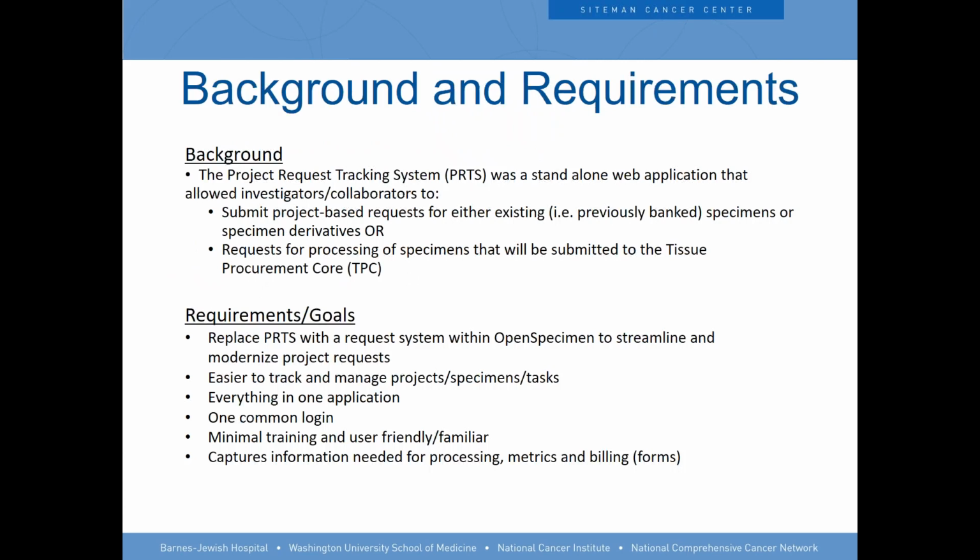So the background on this is that the laboratory had this concept around this project request tracking system, or what they called the PRTS. It was a standalone web application that didn't have any connection to any other application. So it was hard from a maintenance standpoint, with unique user logins and functionality that was only driven by that application.